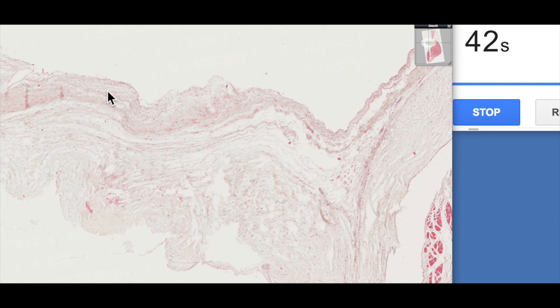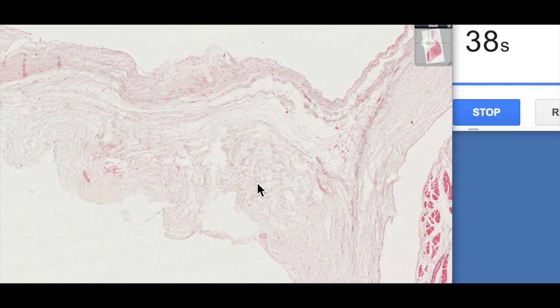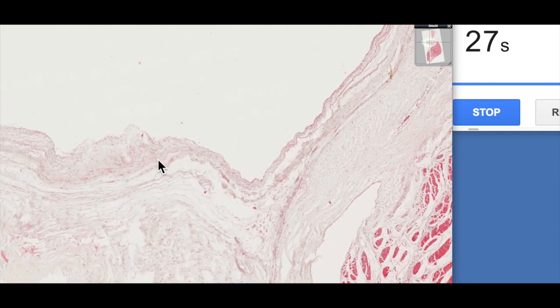If we look at the structure in a little bit more detail, we notice that the structure is different here on the atrial side. This is known as the lamina spongiosa, whereas down on the ventricular side this is known as the lamina fibrosa. More connective tissue, and you can see this is a lot more cellular than we see with the ventricle.